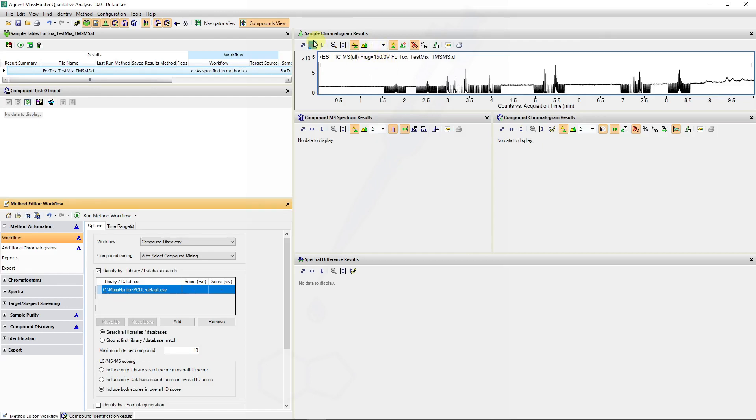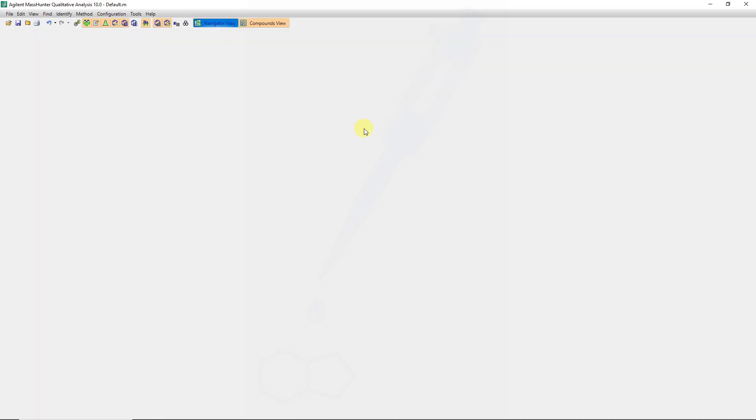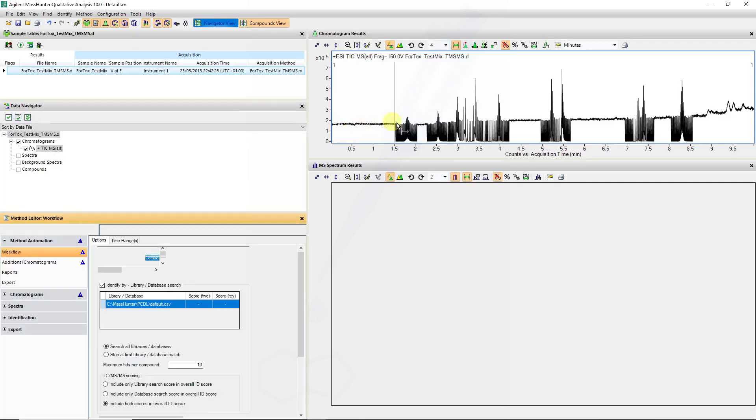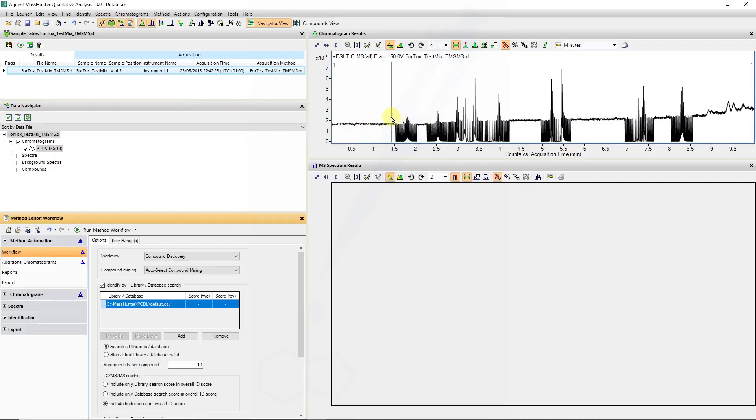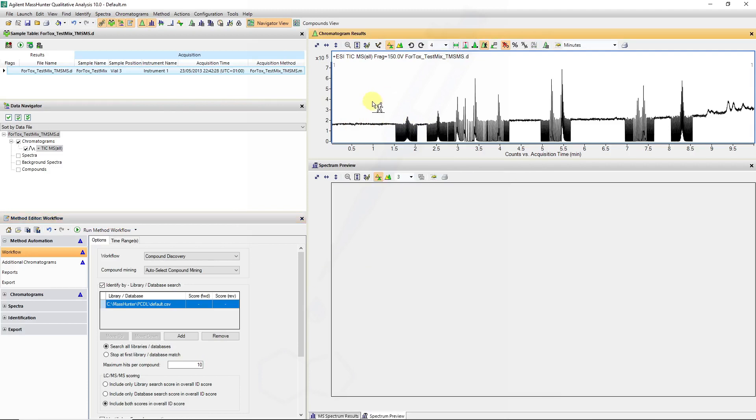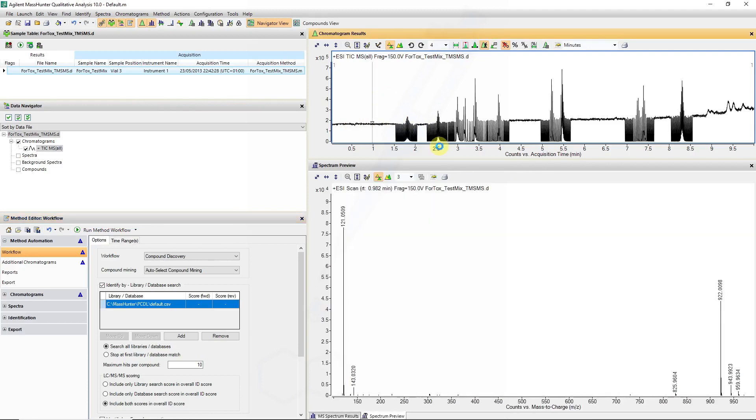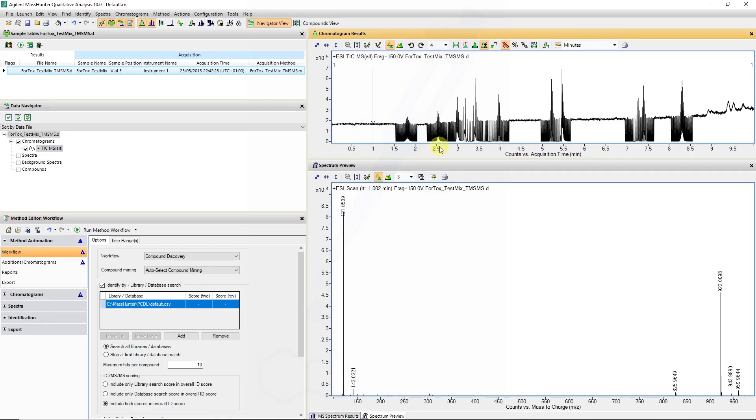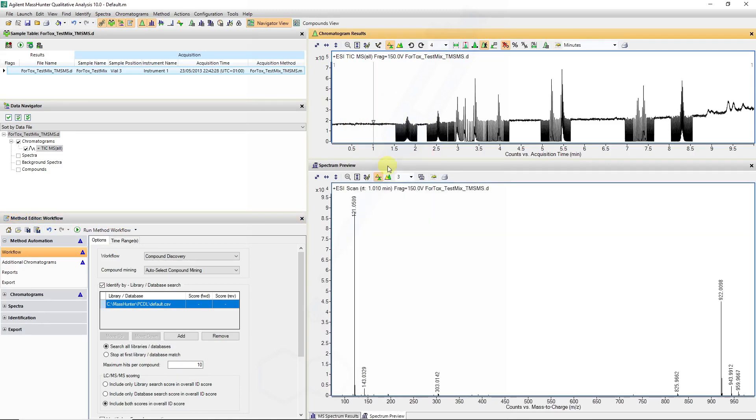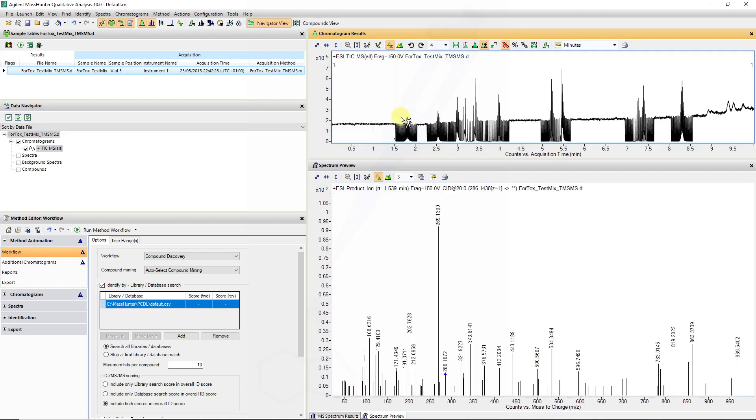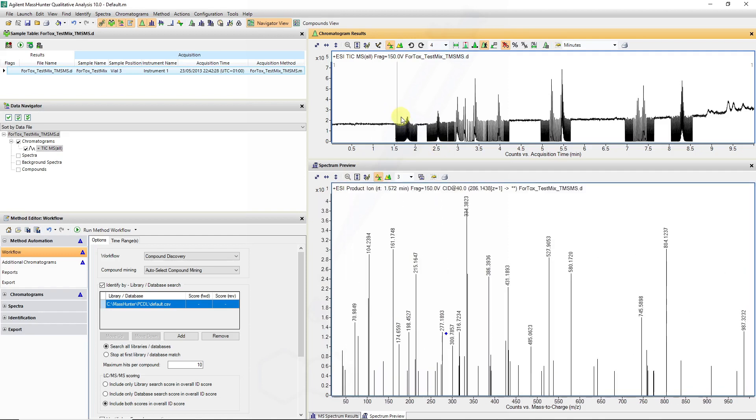Notice when you open this, even in the navigator view, there are regions in the total ion chromatogram where we have TOF MS data and you can see that specified ESI scan, and then there are regions where MS-MS has been performed due to the nature of that target inclusion list.